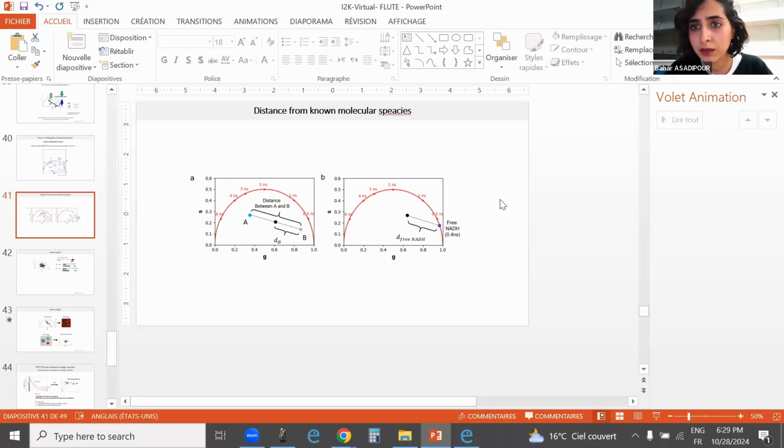If you have two separated clusters of signals, mCherry in the nucleus and NADH in the cytoplasm, would you expect to obtain two dots in the phasor plot? Or is it more like a large cloud, and everything is sort of bound together? Probably not two separate clouds, but what you can do is perform cluster analysis and see which pixel corresponds to what location in the phasor. I'm going to show you right now in the data that we have, if that answers your question.